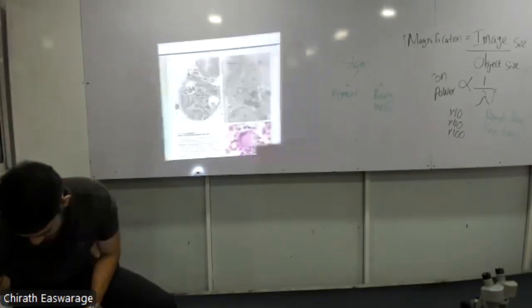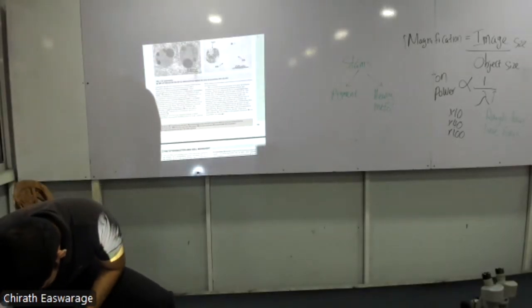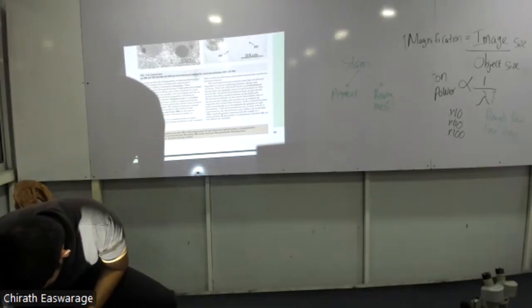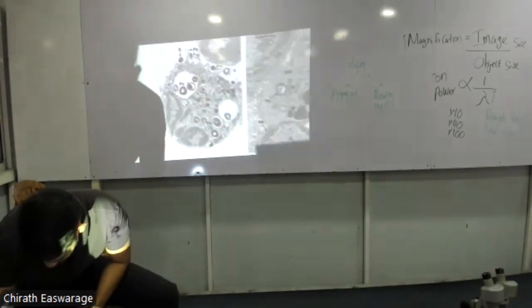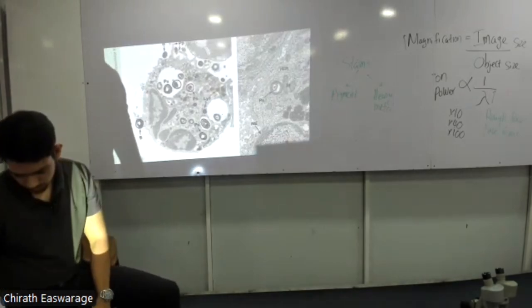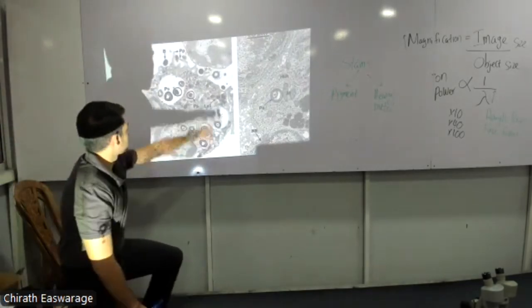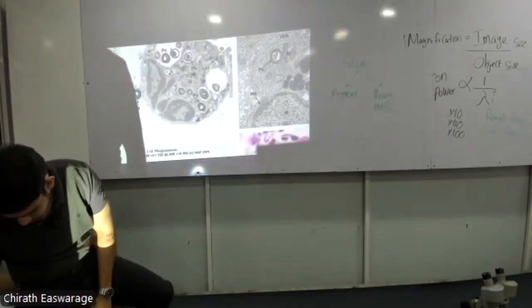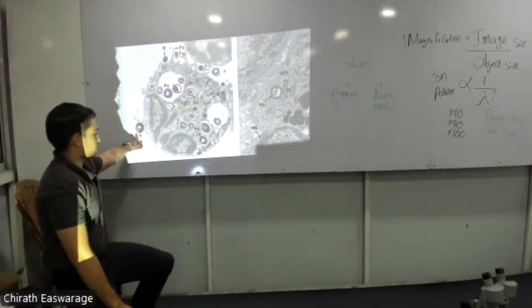Let me just check what these are. B is a bacteria, lysosome. Ah, yes. So what is happening? This cell is eating other cells. So this is a big cell. I think, what is it? It's not given, right? This is a bacterial cell, small one.